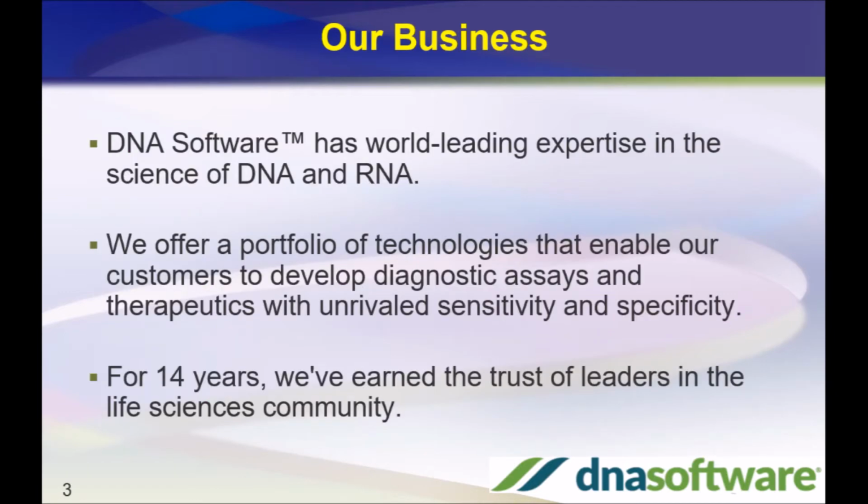So DNA Software has leading expertise in the science of both DNA and RNA. We offer a portfolio of technologies to provide exquisite specificity and sensitivity for those doing molecular diagnostics and related DNA molecular detection.